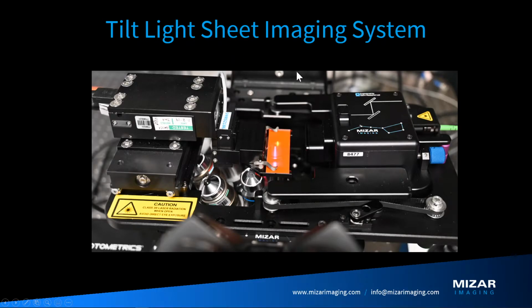So again, here's the tilt. On the right, we have the light sheet generator. This generates the light sheet and positions the sheet over the objective. On the left is the XY piezo stage that holds the sample and will then scan the sample through the sheet. So the sheet is fixed over the objective, and the sample scans through the sheet.